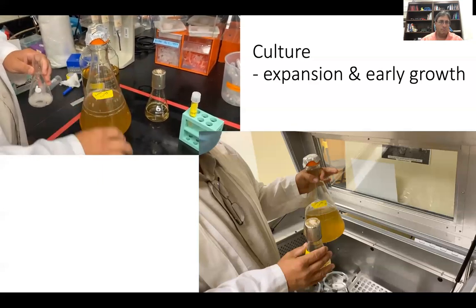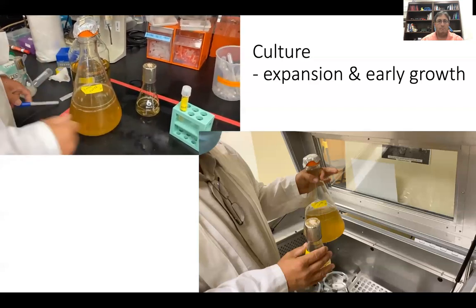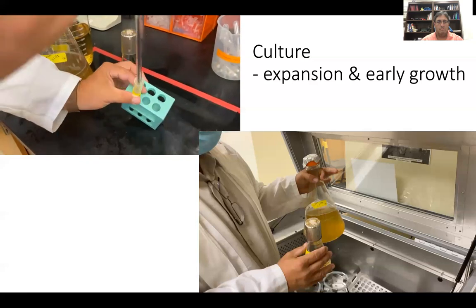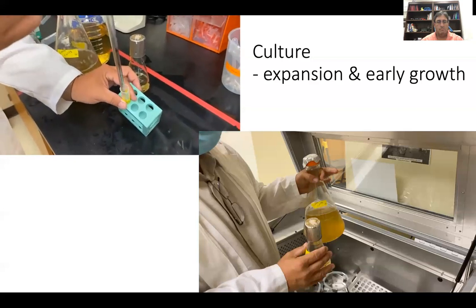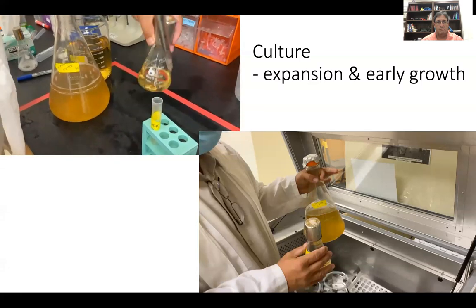Flip it. Name on there. And we'll take 1 ml with culture. And see this liquid culture.